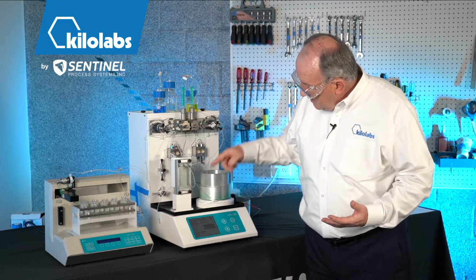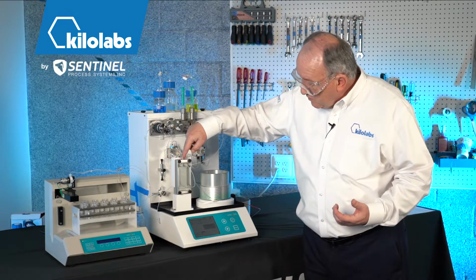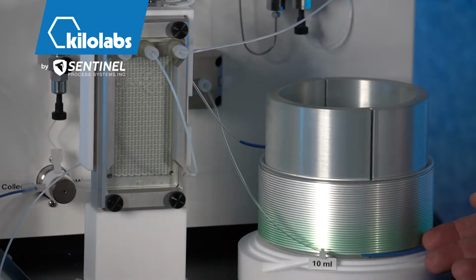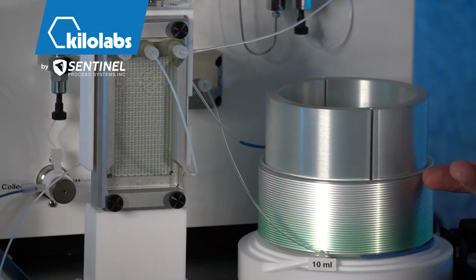As you can see, the chip is becoming less and less green as we rinse it with solvent, and the green band in the coil is now starting to move. It's flowing from the bottom to the top, moving through the coil at roughly 2 ml per minute total flow, or 5 minutes of residence time.